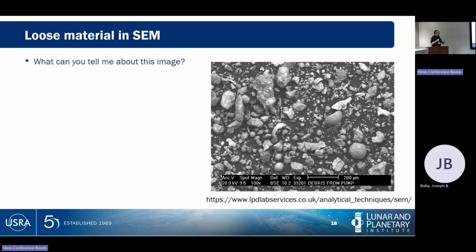Okay. First question. What type of image is this? Correct. Everybody here? Where it says in the table, it's a BSE image, it's a backscattered electron image.